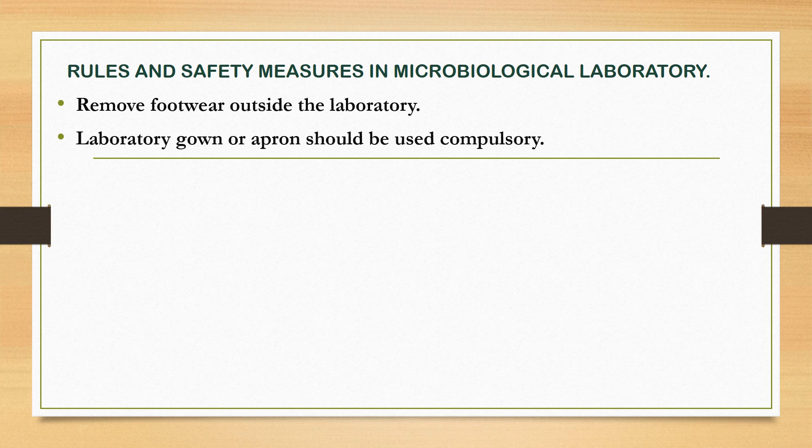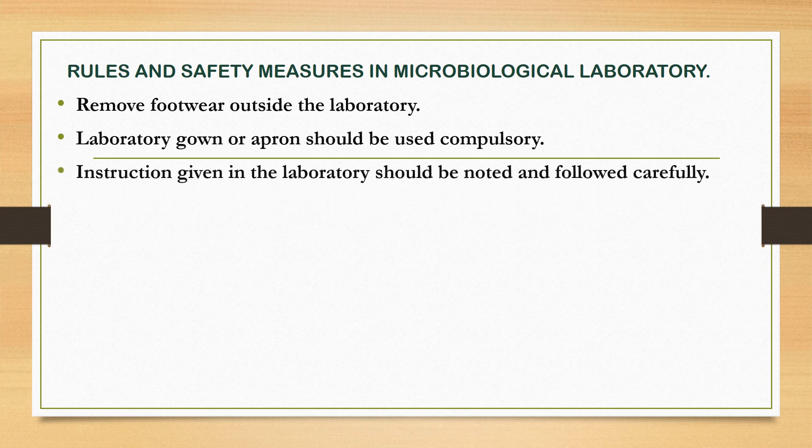Second, a laboratory gown or apron should be used compulsorily. As we know, dyes and chemicals are used in the laboratory, which can harm our skin as well as damage our clothes. So, laboratory gowns and aprons should be used compulsorily. The next rule is that instructions given in the laboratory should be noted and followed carefully.